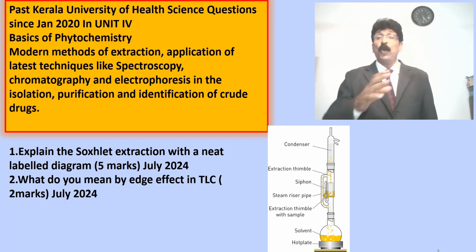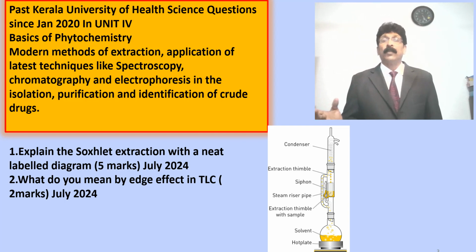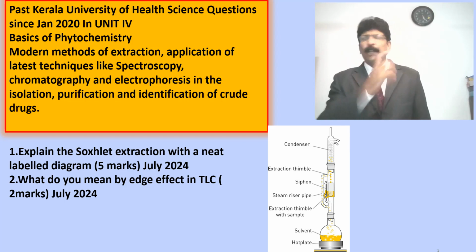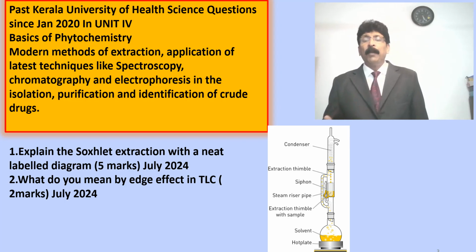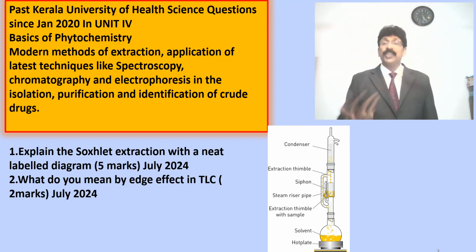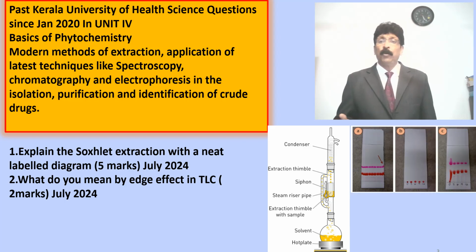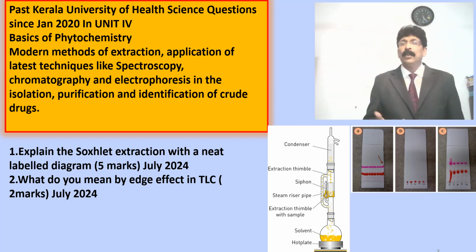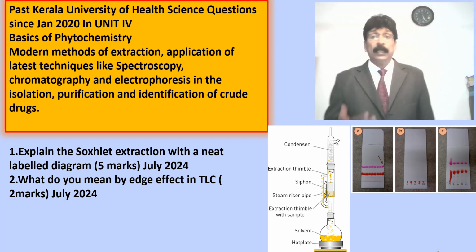And also about spectroscopic methods: what is their application for herbal formulations and herbal drugs, isolation and characterization of compounds. You should know about various spectral methods, UV, IR, NMR, mass, and even many other emission spectroscopy is needed for you to know certain things. This is just a picture I am giving you about the edge effect. We will have a full detailed discussion when I explain thin layer chromatography.